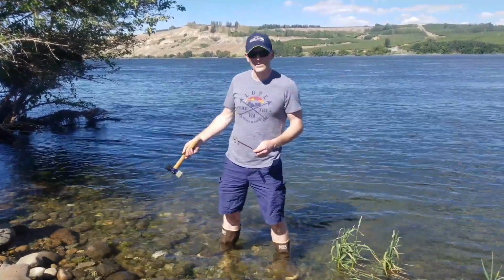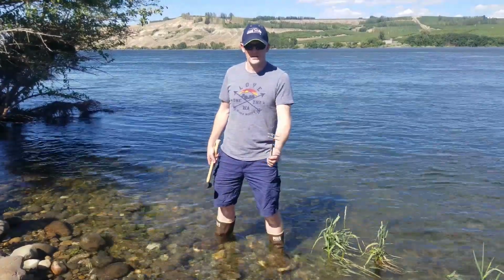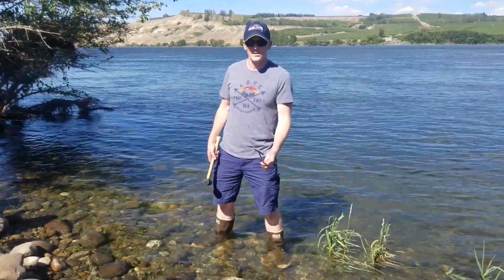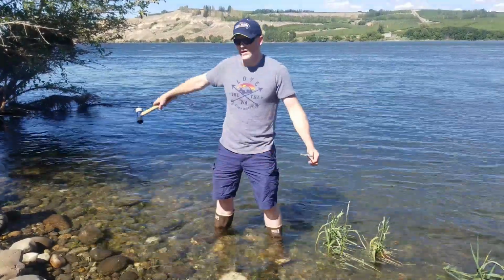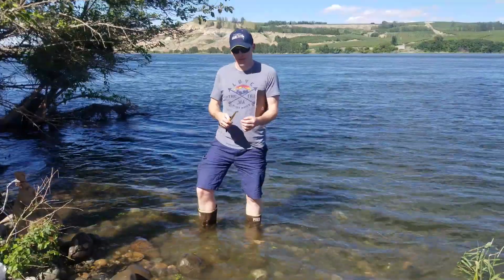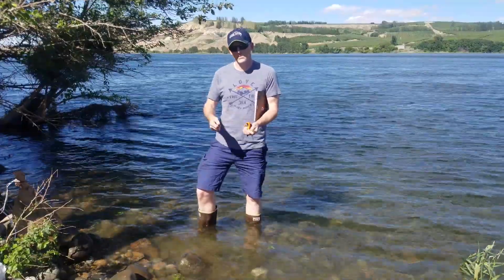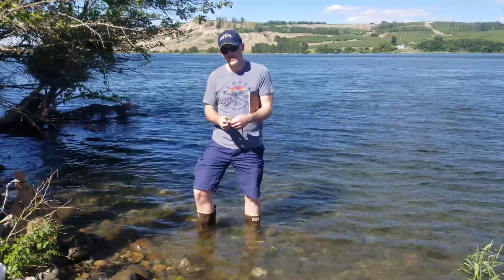What you want to do is, after you get the first one installed, come 2 meters downstream and install a second push point there, and then go 2 meters upstream and install another push point in a parallel line, or parallel to flow. After you pull the support rod out of the push point, you want to measure the distance from the riverbed to the top of the push point.